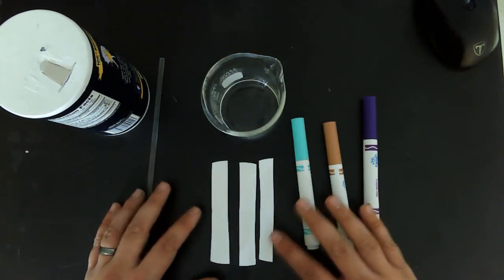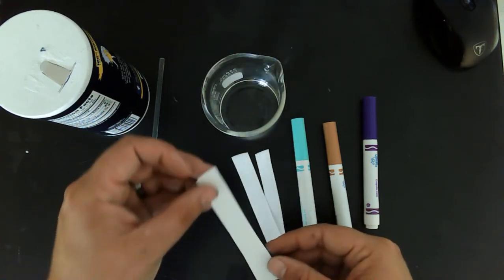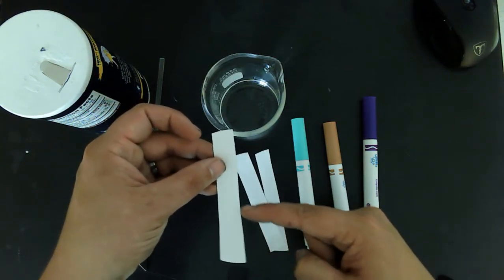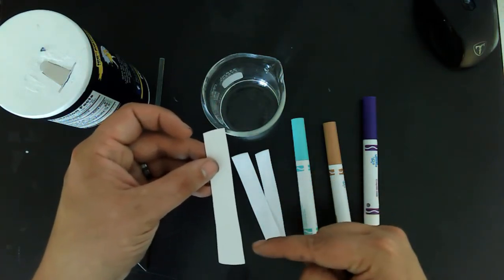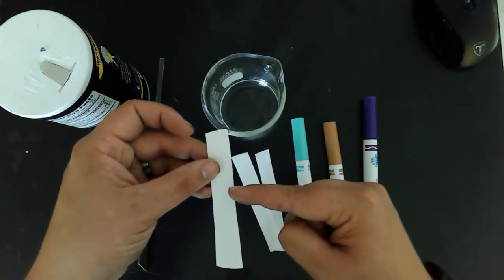Chromatography is the separation of mixtures. As we do this lab, we're going to put a marker line down at the bottom of this paper, and the pigments will travel up the paper. If it's made up of two different pigments, the larger molecules won't travel as fast and will travel slowly. The smaller molecules will travel up much more quickly.